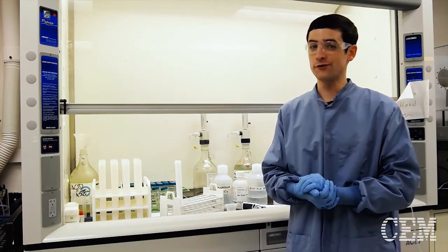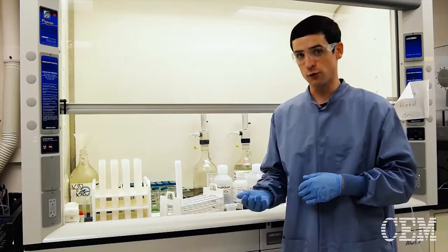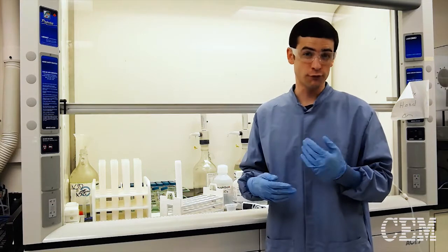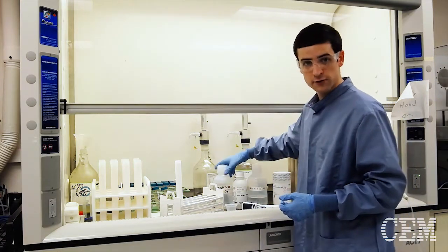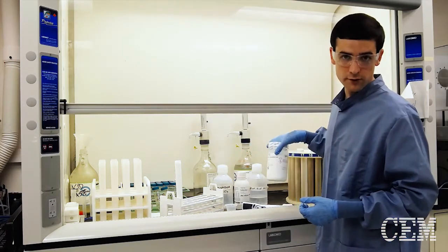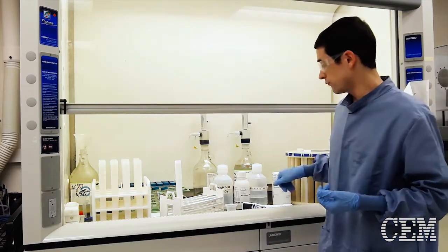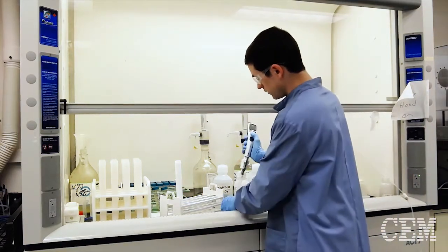So microwave cleaning is when you're going to have really dirty stuff or really low level requirements such as low PPB, low PPT, and it may take a couple of runs to get it that clean. So what you need to do is you take your distilled acids such as this, or ultra pure, or even EDTA solution. So what you would do is you take the solid EDTA and make it 5% weight per volume. Take 10 mLs of any of these, put it in your vessel, such as this.